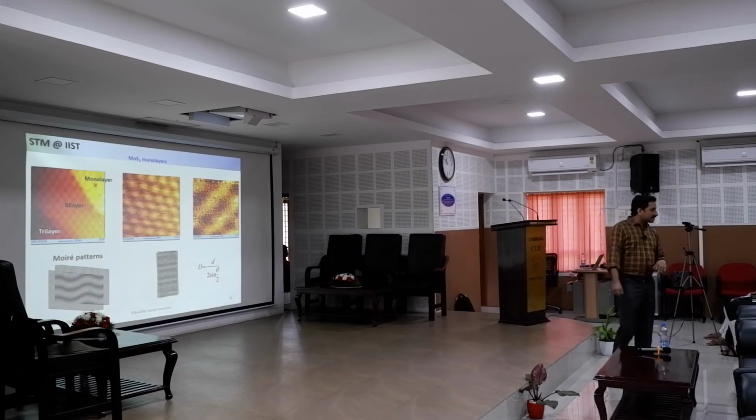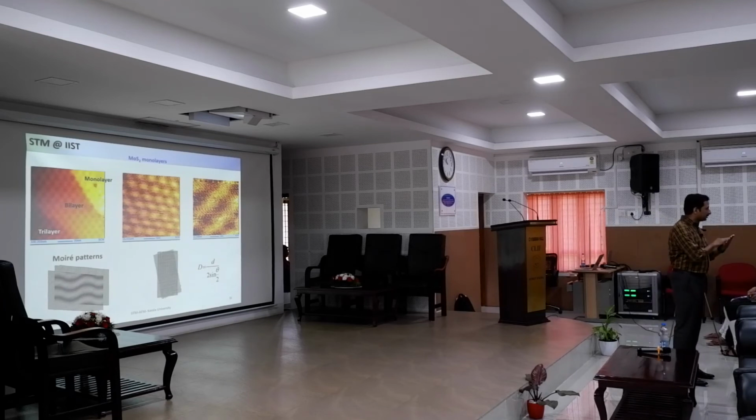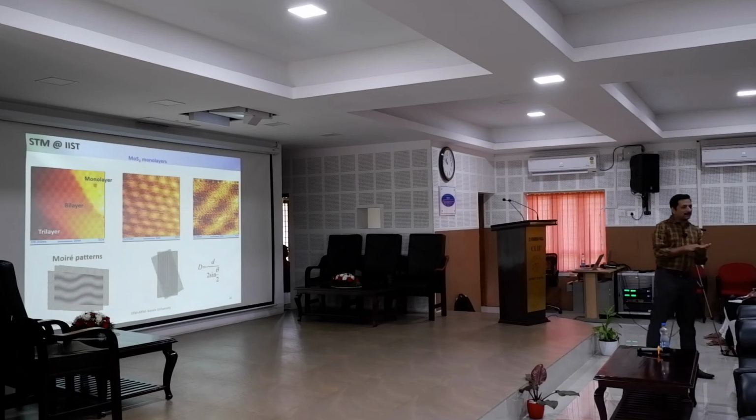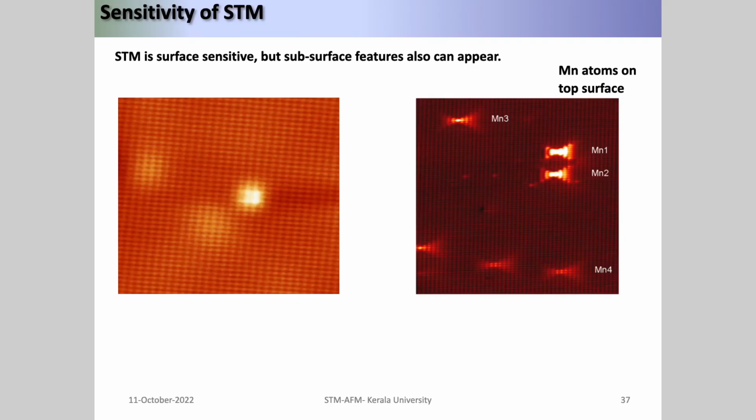And this is something called the magic angle of MoS2. At a particular angle, you will get it. People had predicted it. We didn't know this. So what happened is that after getting this, now we are not getting it anymore. We want to publish it, but not anymore. We are not getting that image. So there is a lot of luck.